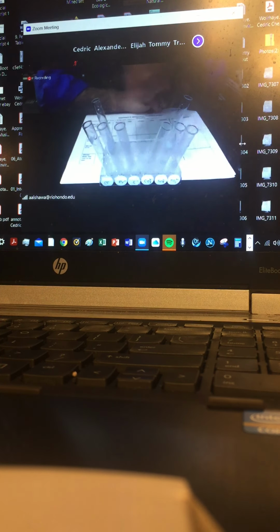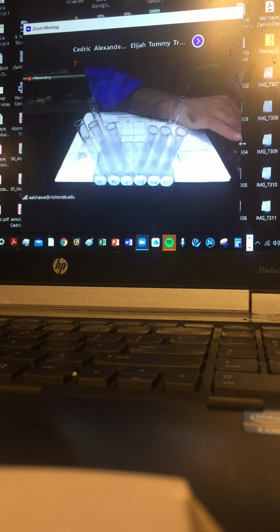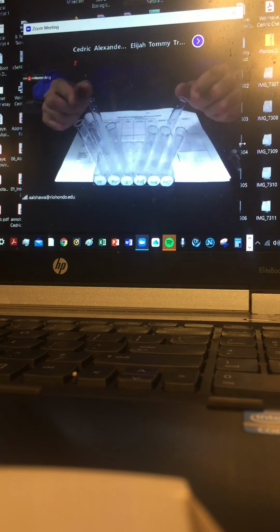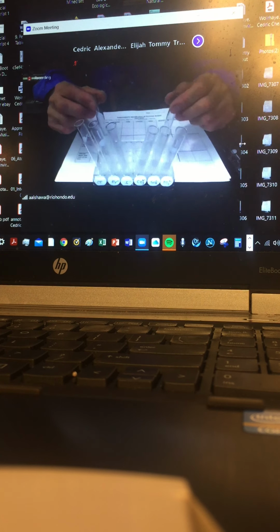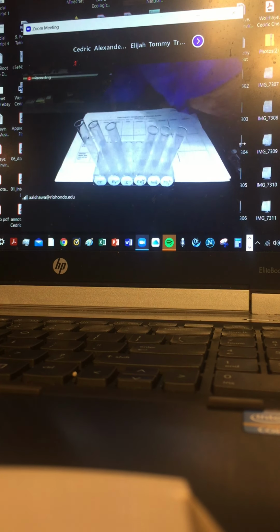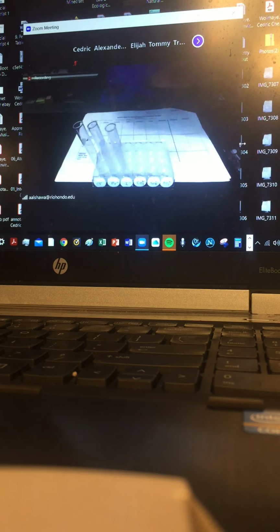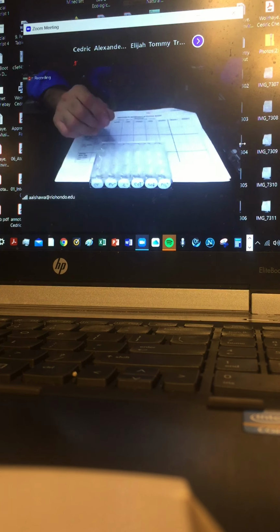For the second part, I want to refresh all these test tubes. I have plenty of those clean test tubes. All right, so back to unknown 1, unknown 2. Let me position them on the side. And here are the polyatomic ions. Here are the halides.